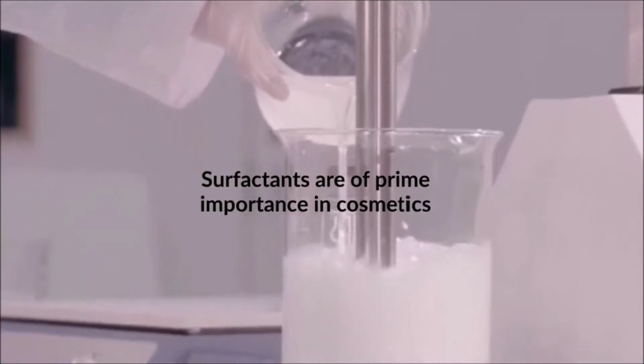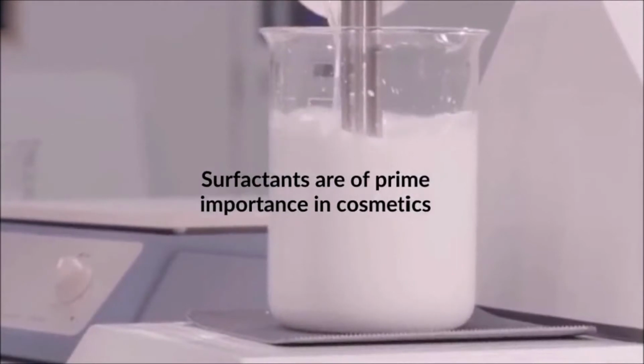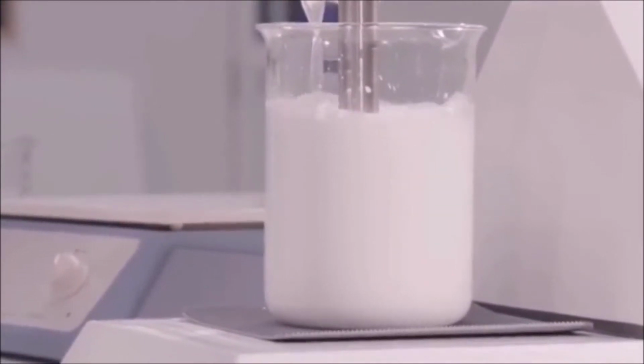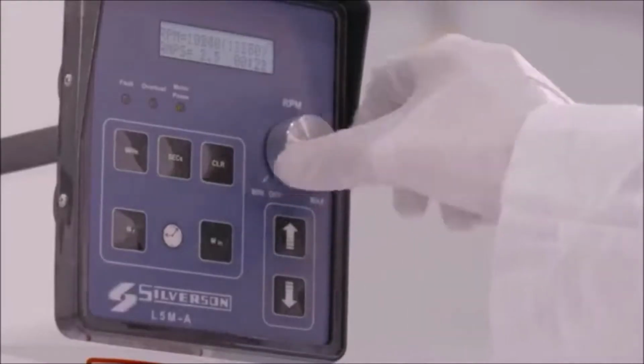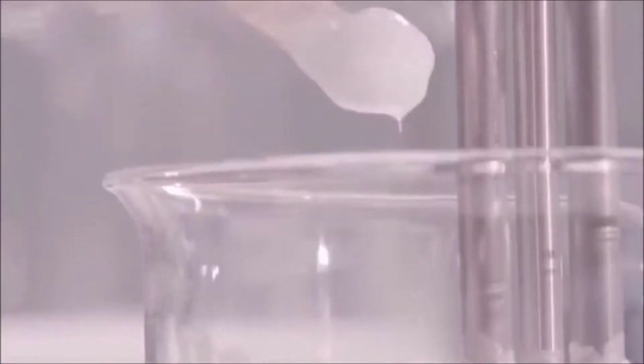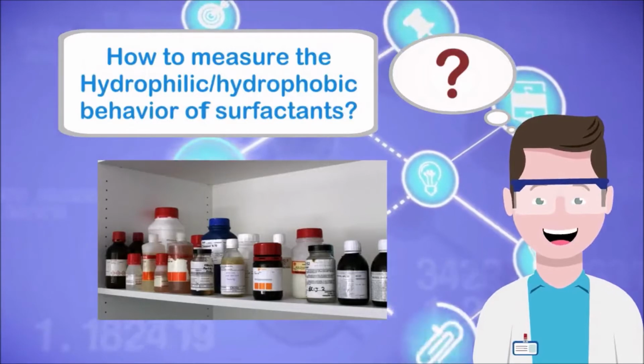Surfactants are of prime importance in cosmetic preparations. The choice of an appropriate surfactant is an important step to formulate emulsions and microemulsions. There are several methods to compare the hydrophilic-lipophilic balance. How to measure the hydrophilic-hydrophobic behavior of surfactants?